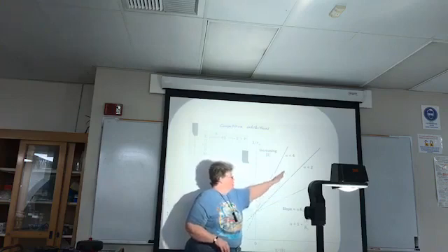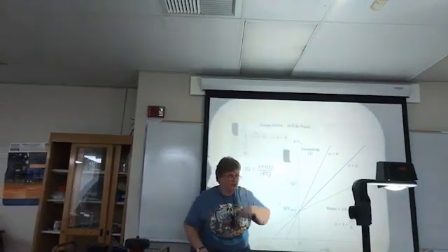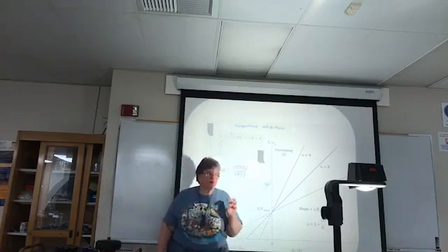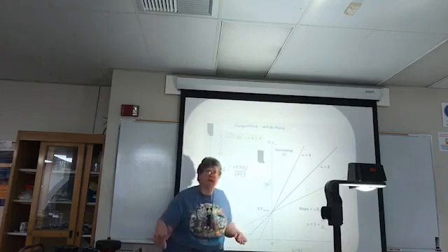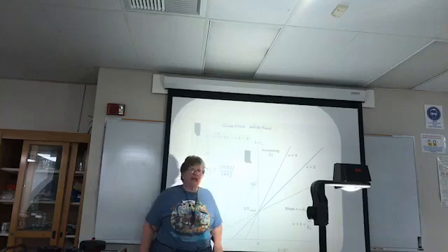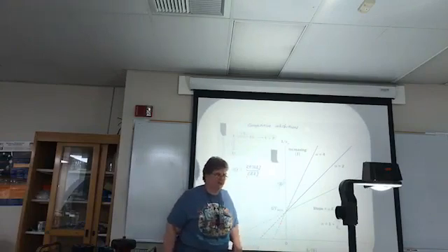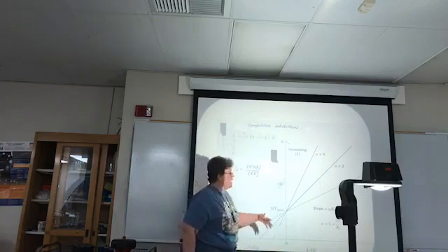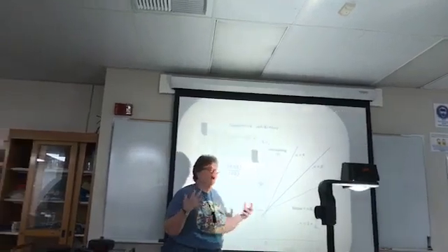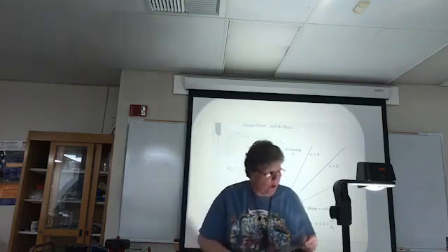So as you increase the inhibitor, the line here is increasing because the rate of the reaction is potentially decreasing with the inhibitor. But as you move towards infinite substrate concentration with a fixed amount of inhibitor, you can potentially outcompete all that inhibitor. So you have a certain amount of inhibitor, but by increasing the substrate more and more, you can get to your same Vmax. So when you are looking at the kinetics here, your 1 over Vmax stays the same, but your Km is changing because it's going to take more substrate to get to this same Vmax. So your apparent binding affinity of the substrate with the enzyme is what is changing, even though the maximal velocity is staying the same.